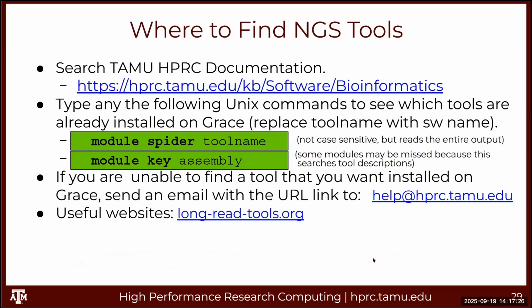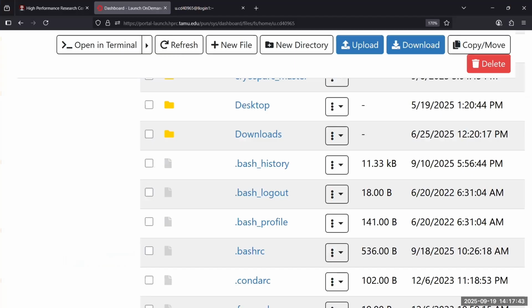So is everyone familiar with searching for tools using Module Spider? What about you? You familiar with Module Spider? I'm just starting, confused. Okay. What about you? Use Module Spider? Yes. Okay.